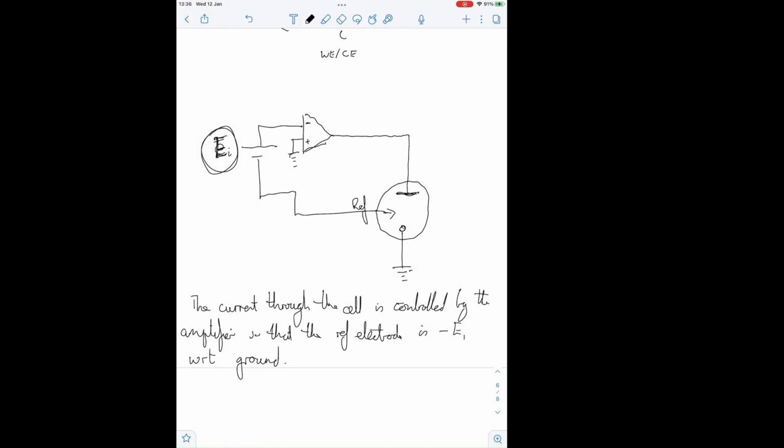The other ones are pulsed lasers. When I was working at Bristol, where they do a lot of pulsed laser work, we had a horrible time with people with the pulsed lasers mucking up our measurements by mucking up the ground circuit. So be aware of pulsed lasers and of where you're grounding to.